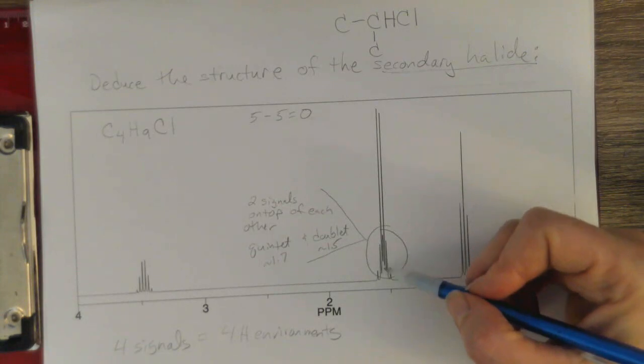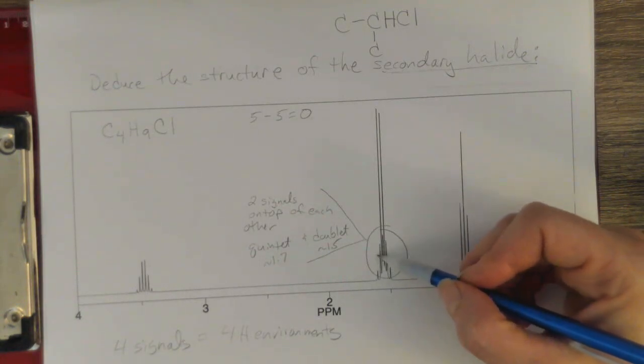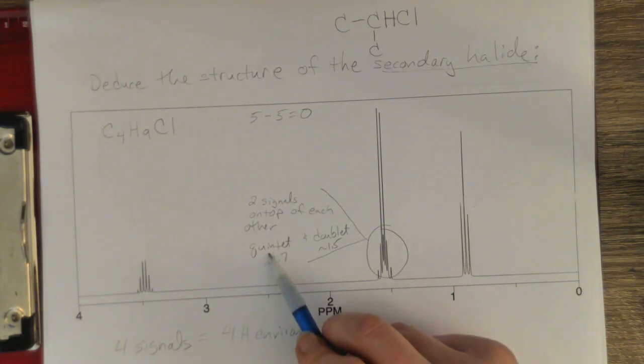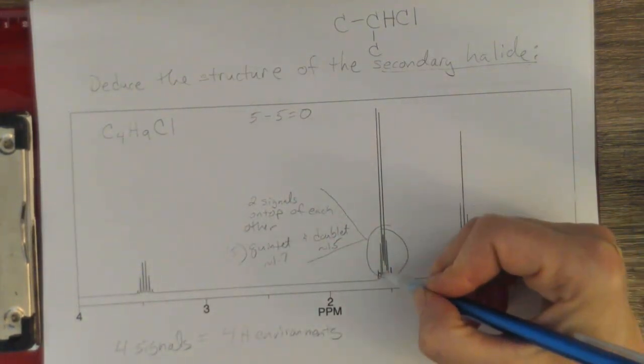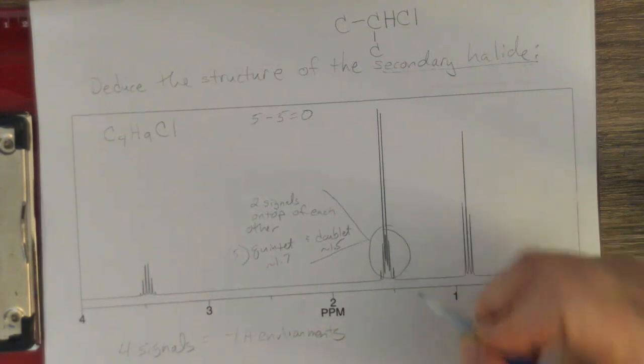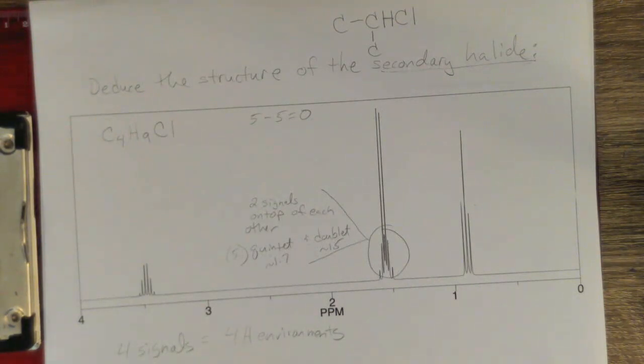Okay. And then if I look down here, this is an odd multiplet, and I'm telling you that it's a quintet, so that's 5 peaks. Okay, I guess you really can see that: 1, 2, 3, 4, 5. But this up here is the doublet.